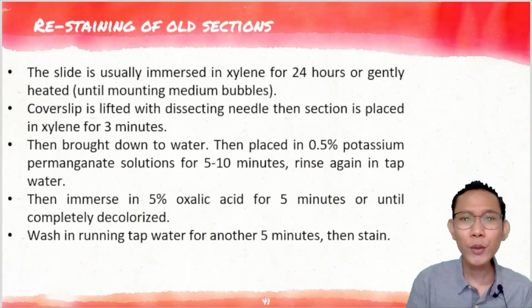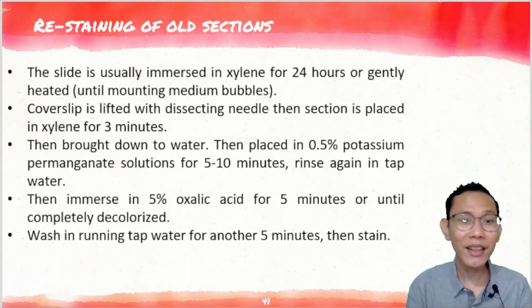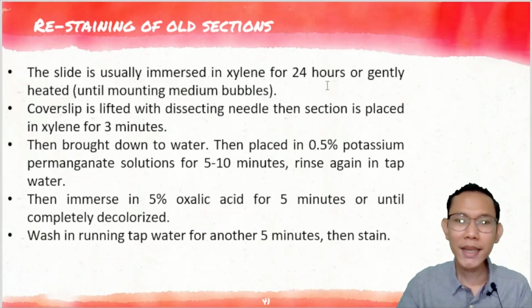I guess we are also down to our last slide. We also have your restaining of your old section. So restaining of your old section, basic lang. You also have to, the old slide is usually immersed in your xylene for 24 hours or gently heated until mounting medium bubble. So then your cover slip is lifted. So tatanggalin mo yung cover slip and placed in your xylene for 3 minutes. Then brought down to water.